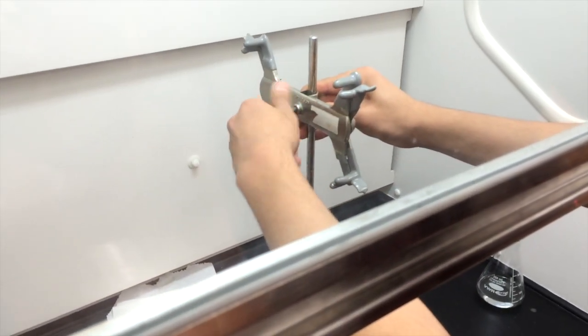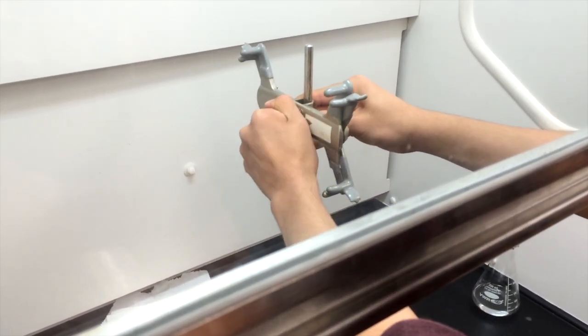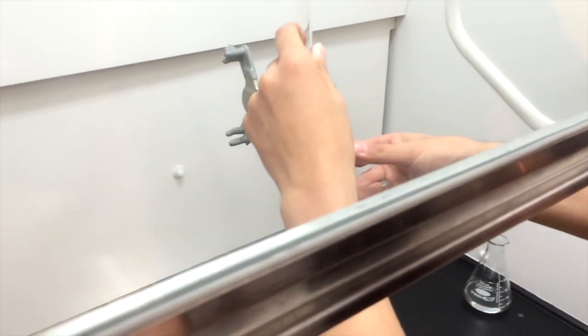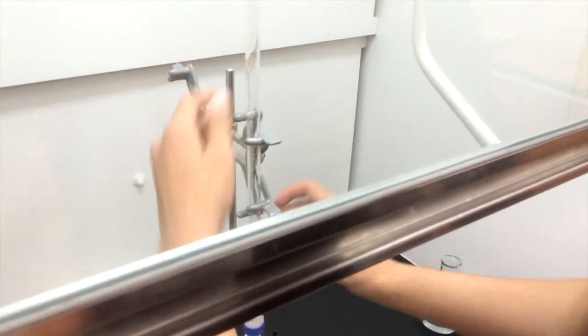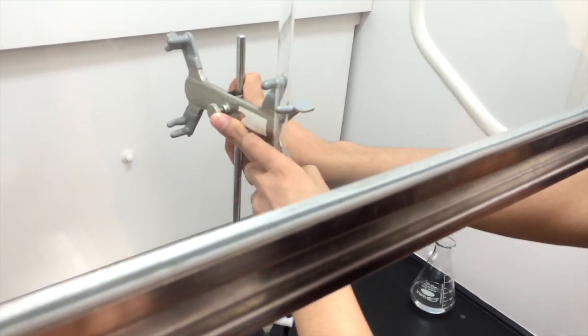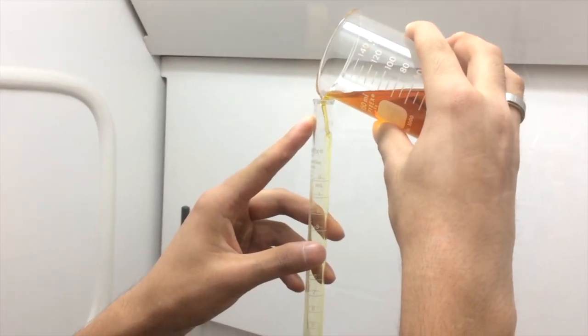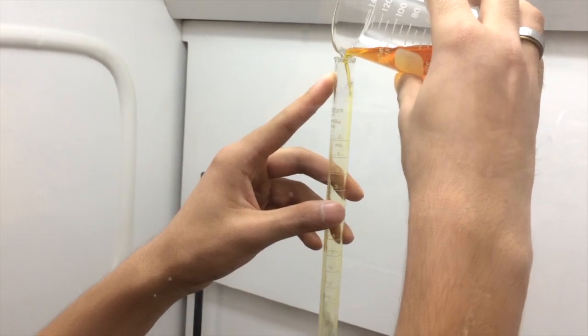Using a burette holder, assemble your burette so that it is stable and level. Transfer some iodine solution into the opening of the burette; you can use a funnel to prevent any spills.